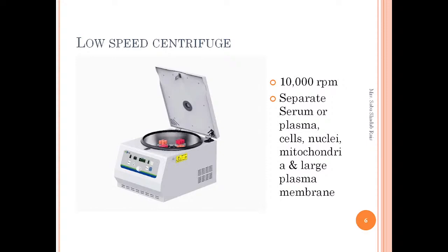When you go into TY, at that time you will learn that we are doing many practicals on plasma, because this plasma has many antibodies and other relevant substances which can be used to find out the protein estimation, then your lipid estimation, lipid profile.